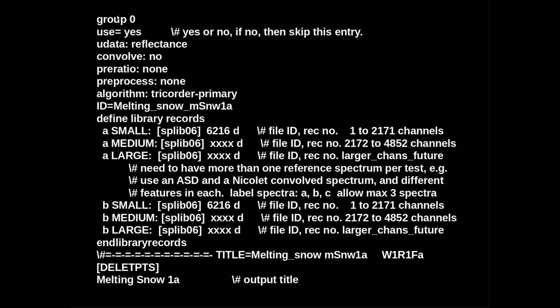So just think of this as a group number for any example. You can turn it on and off if you just turn this to no, and then it wouldn't be mapped, but that's a custom change to the expert system.